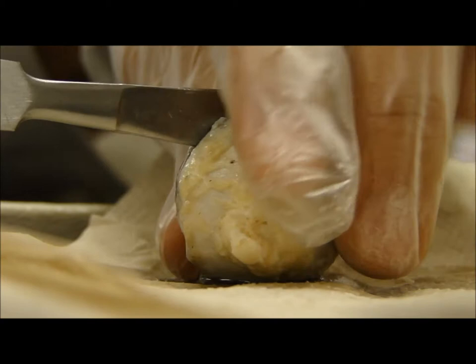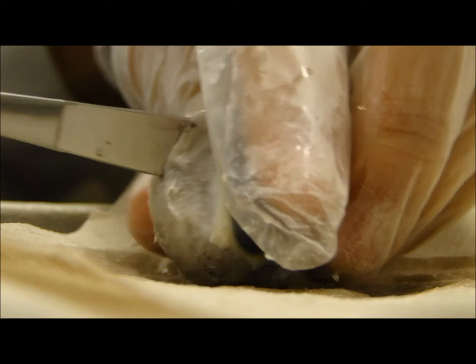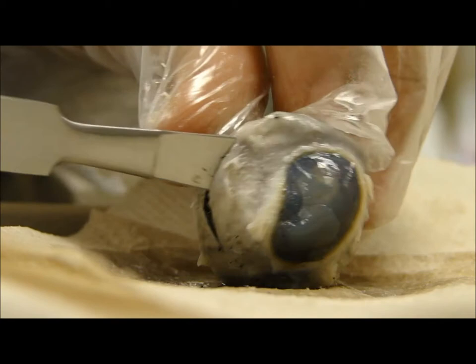That's not water. So once you've made a cut around the eyeball, separate the eye into halves. Let the vitreous humor and any associated structures slowly slide out of the eye. All that more stuff. Dude, it's purple. Boom.